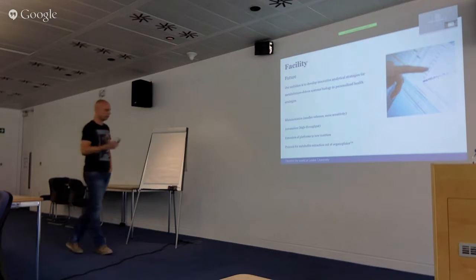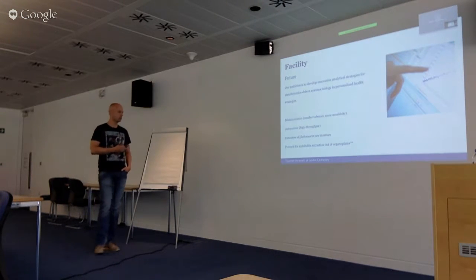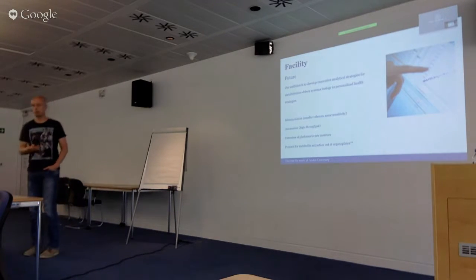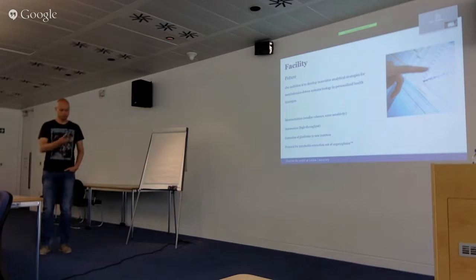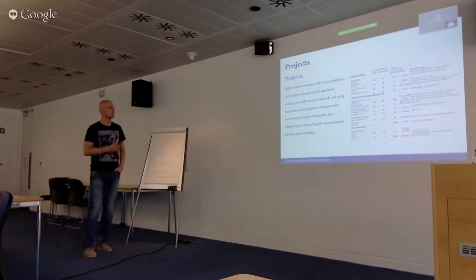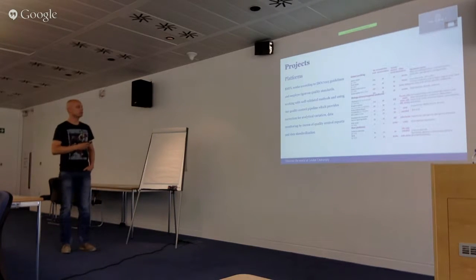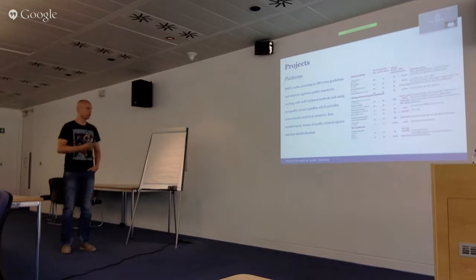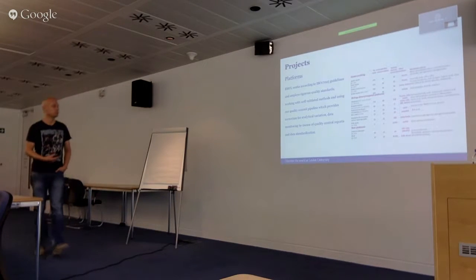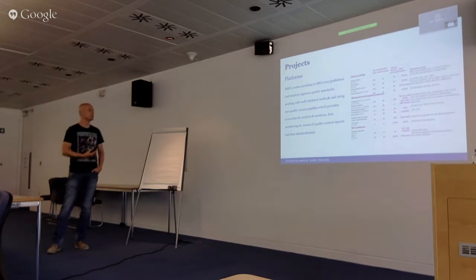We want to involve matrices, and we're going to use organoplates. We're going to build a platform around it. This is something we developed in a spin-off company. I'm not sure if anybody can read that, but these are the platforms that we have. We're trying to work according to the ISO standards. Also, because of the ISO standards, we have defined how we handle data, data management, let's say.